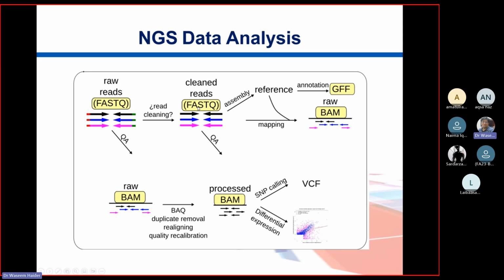Okay, what is a read, by the way? A read, a read fragment. So anybody, what is a read or a read fragment? A sequence, sir. Yeah, a sequenced fragment, right? So you take the DNA as a big, lengthy molecule, and then you break it into small fragments.